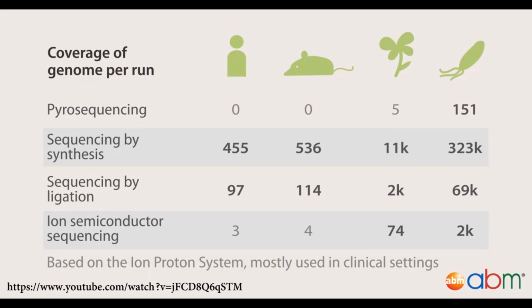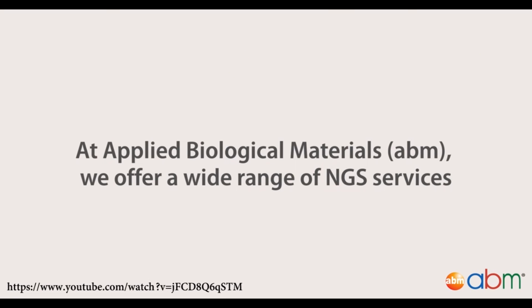The Ion Proton machine is used mostly in clinical settings because it is able to provide a sufficient size output within 2 hours.